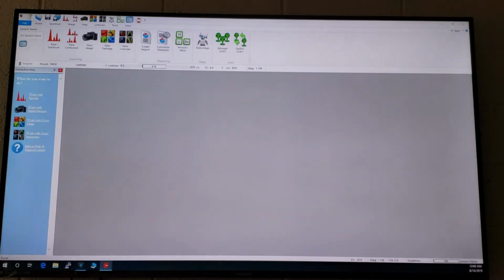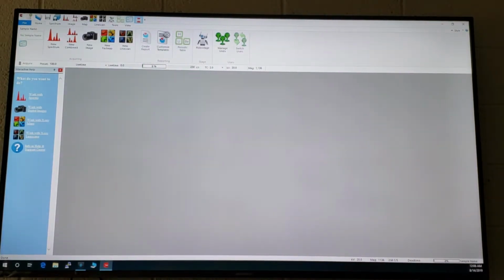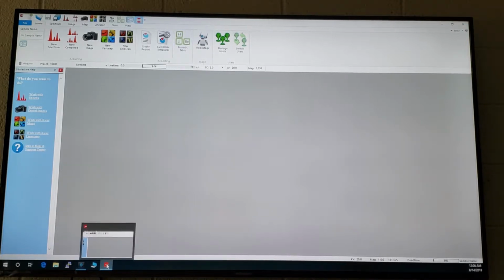Oh, is that the icon down the lower right? Yeah, in the middle of the tray on the screen there. That's it, yeah, all right. That's us right now. This is the SEM, that's my PC, and that's the IXRF icon. I got it, I got it.